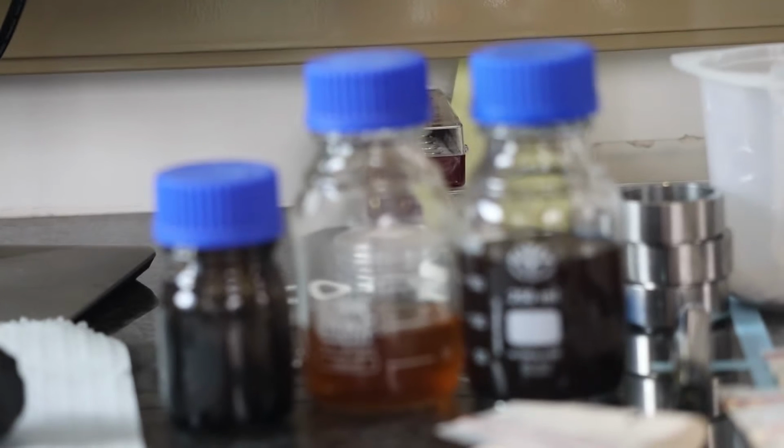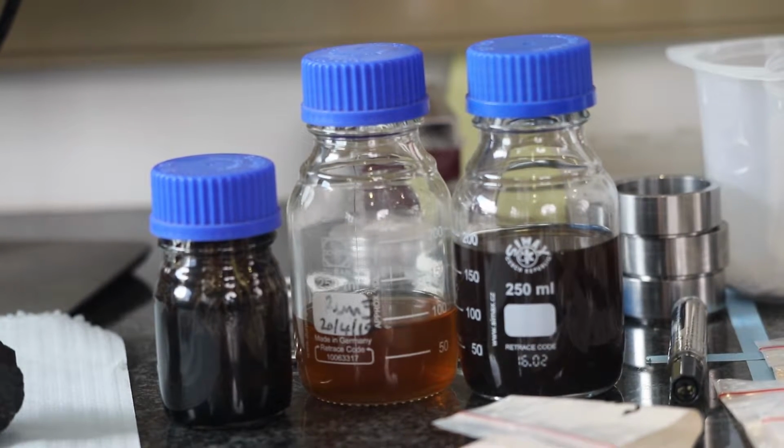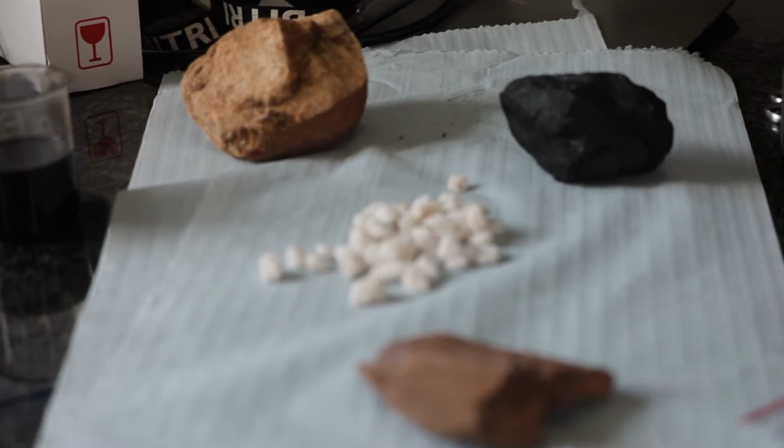Generally, the X-ray interacts with the material, and then we are able to characterize the elemental composition of the materials from sodium to heavy materials like lead. We have different types of machines that I work with, and they have their various types of testing.